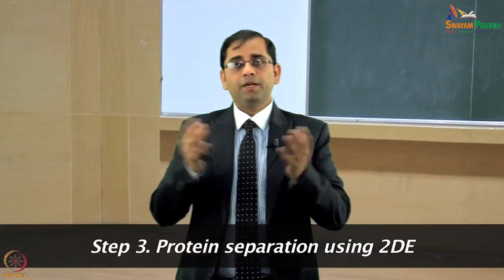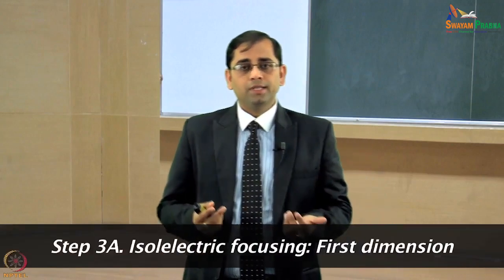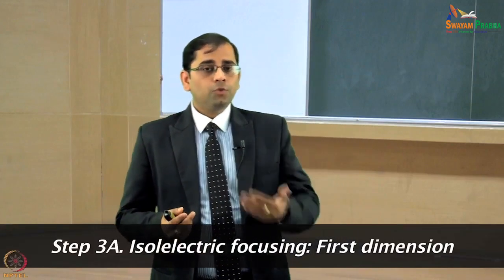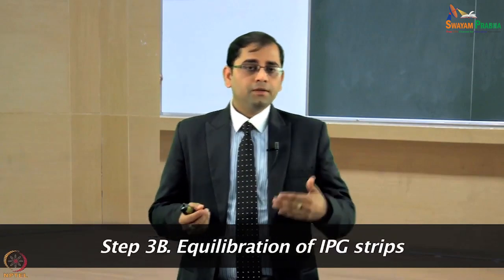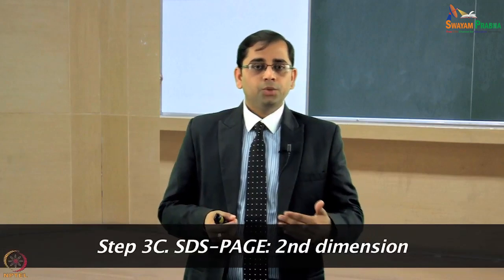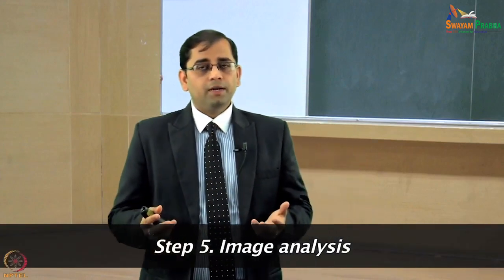And now your intention is to separate those thousands of proteins present in that mixture using two-dimensional electrophoresis. To do that, the very first step is isoelectric focusing in the first dimension. Then you want to prepare the strips to separate them in the SDS-PAGE, and to do that you are doing an equilibration of IPG strips. Then the next step is the second dimension separation using SDS-PAGE. Then you want to visualize the gels using staining techniques, and then do the image analysis using various software. And then those proteins which look interesting to you, you want to excise and identify using mass spectrometry. So, this is a typical workflow.